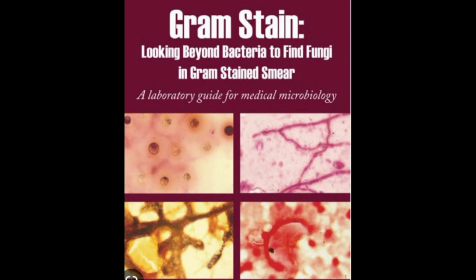Principle: to demonstrate the differential staining properties of bacteria. Gram positive bacteria retain the crystal violet dye after decolorization and appear blue or purple-blue. Gram negative bacteria are not capable of retaining the crystal violet dye after decolorization and are counterstained red by dilute carbol fuchsin. Performance of specimen: the organism isolation and identification will usually be performed only if culture is requested.